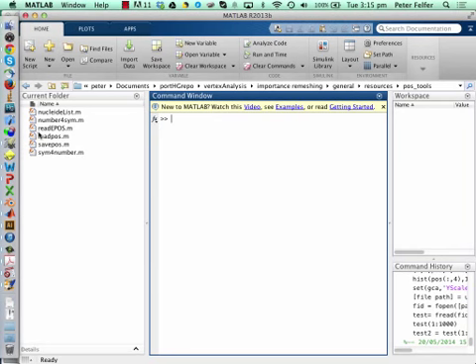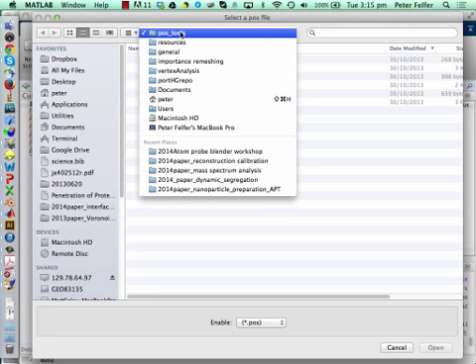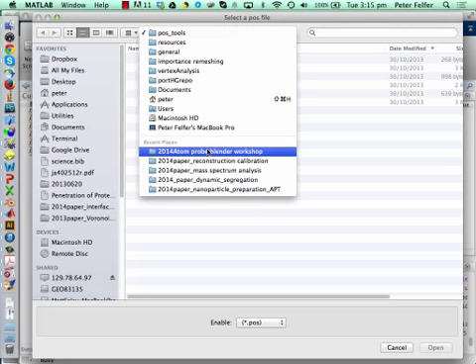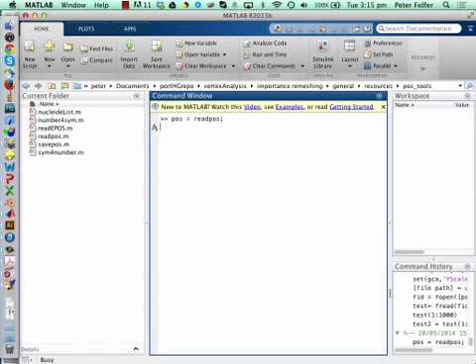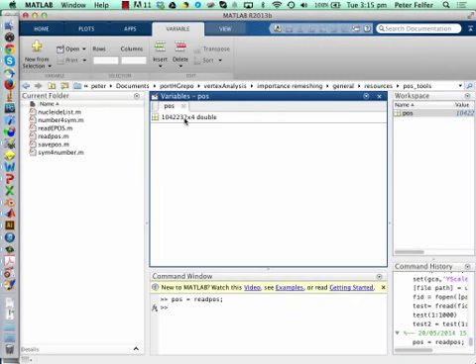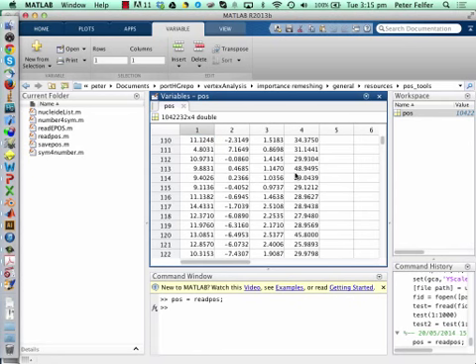If you load it into Matlab, you'll see you've got the read pos and save pos utilities here. Just go pos equals read pos. It will come up with a dialog. Choose the Atom Probe Blender Workshop example data. And there we go. You'll see you've got everything loaded in, with X, Y, Z and mass-to-charge. This is a superalloy, so you'll find a lot of values around 25-ish.